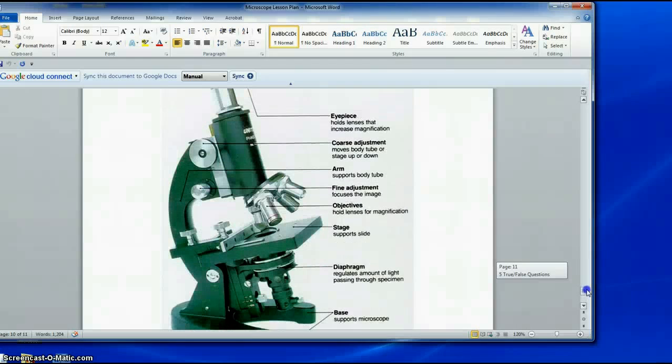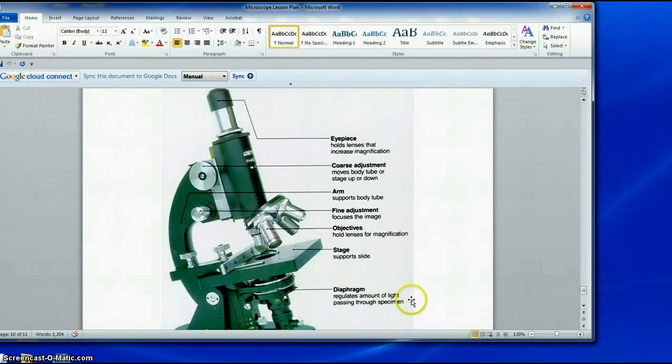A compound microscope is compound because it has a variety of objective lenses. These are the lenses that are closest to the object that you've placed on the stage that you want to examine. The eyepiece can be one or it can be binocular. There are usually two adjustments, and different microscopes are built in different ways. The part in the back that you would hold the microscope from, or that supports all the apparatus, is called the arm. The adjustment is coarse and fine.